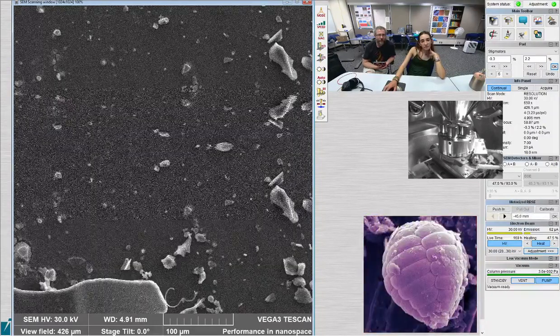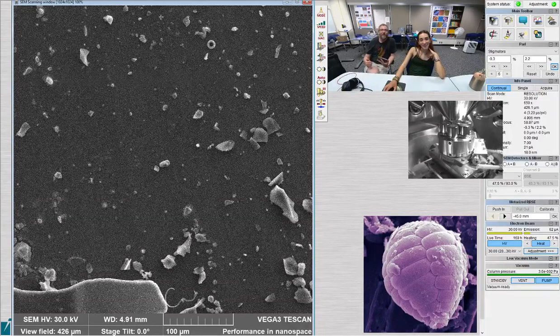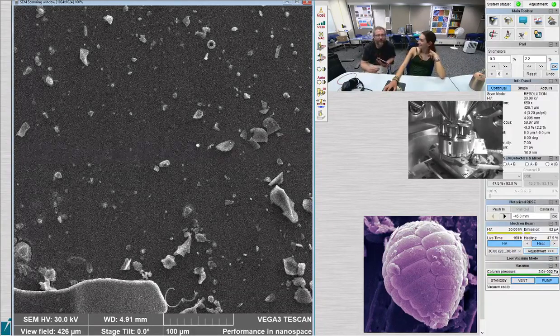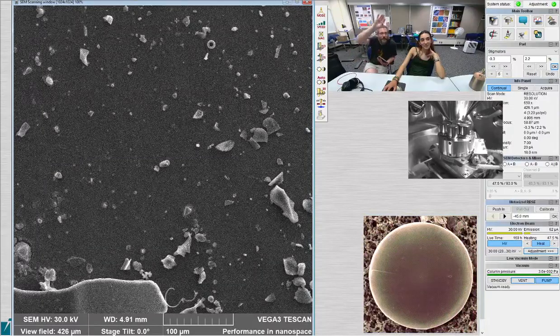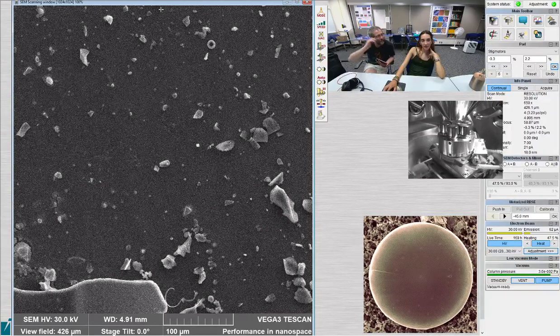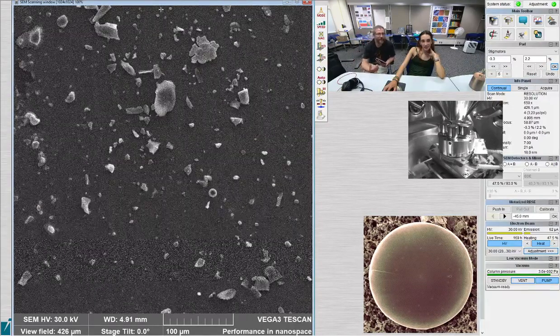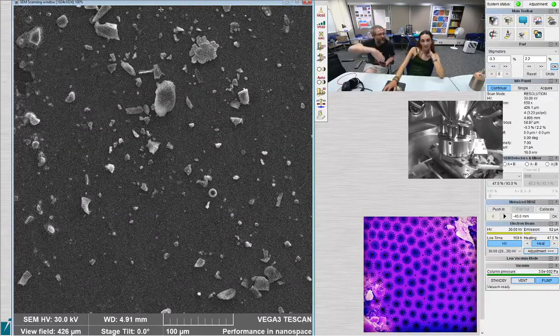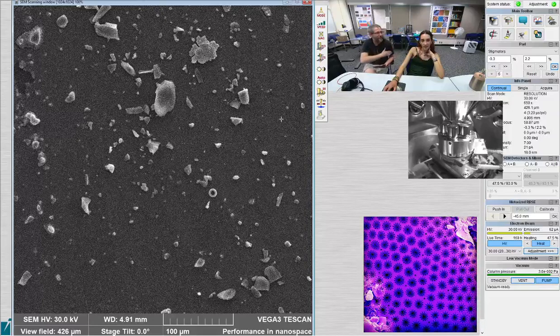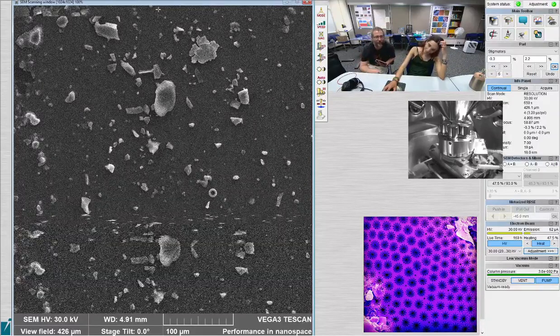Okay. You're being systematic in your search. I'm trying to. So I can tell you some things to help, which is if you click right in the middle at the top, it'll move up one half of a page upward, right? If the scale bar is always the same size and you're always clicking in the same spot, it'll just move like a grid. And then you can just move over two clicks, move down, move over two clicks, move up, and then you can be really systematic, right?